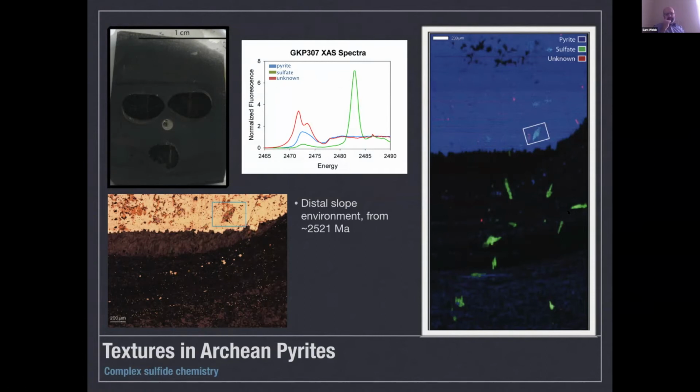But what I really began to find interesting here was this red spectral signature, which is found in these locally discrete, say 5 to 25 micron sections along this sulfate inclusion area. It really had a very odd spectral signature, and for now, I'm labeling it unknown. This is particularly intriguing, and it also co-occurs along with these sulfate rims in this particular sample. So what else can we see about this?